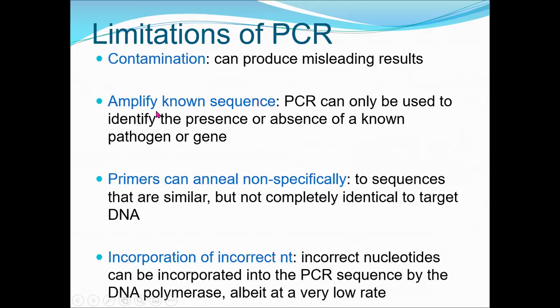Whereas the pre-PCR room is normally sterile, free of DNA. So the chances of contamination are far less if you set up the PCR in the pre-PCR room. Then your PCR machine is kept in the PCR room, and the post-PCR room is where you run the gel electrophoresis. This way you can reduce the contamination.